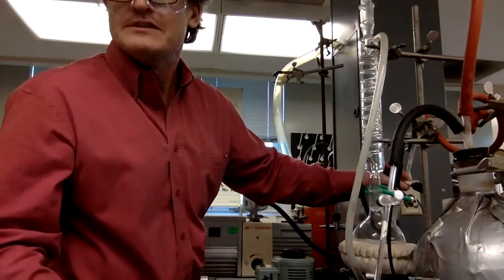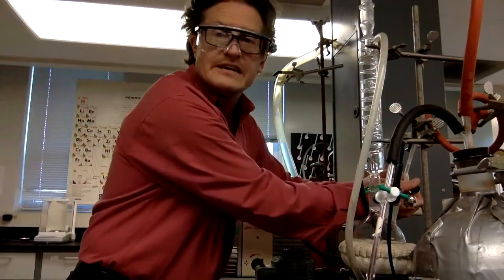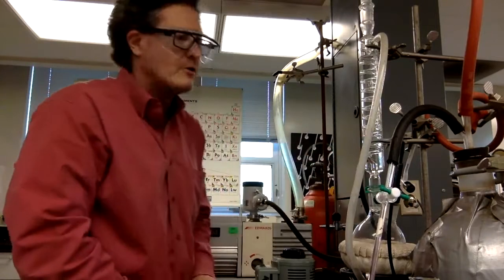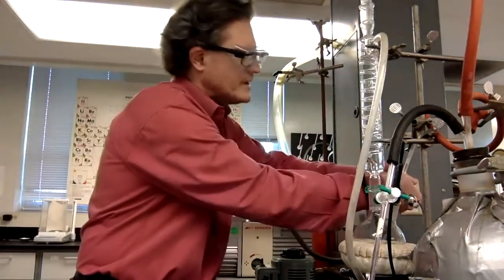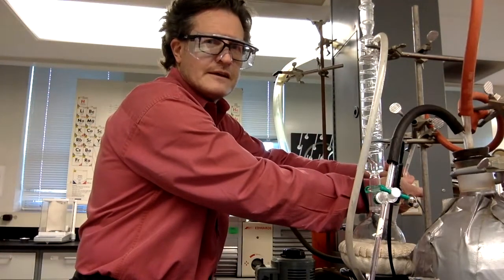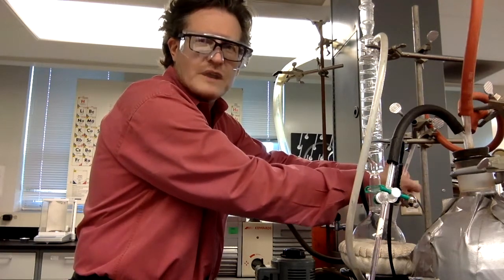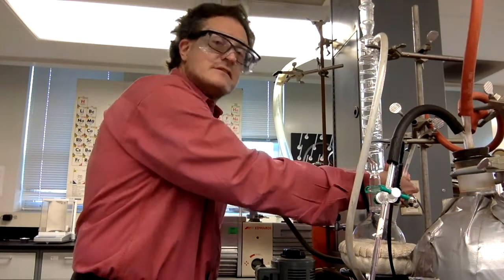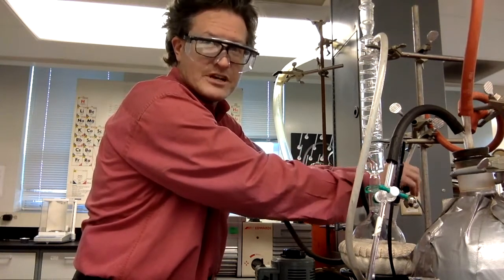The other valve, the one that's back here, is much different. You'll see it has more of a black rotary cap, and it experiences backlash. It's been closed now. When we want to open it, we turn it counterclockwise. At first, it just feels really loose and nothing's happening. That's the backlash. When we change the direction that it was rotated, at first it does nothing. And then you'll feel it catching, and wait for it. There you go. You can hear the pump. When the pump is under load, you can hear its sound change, so you know when it's pumping.